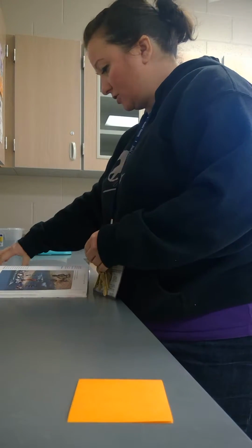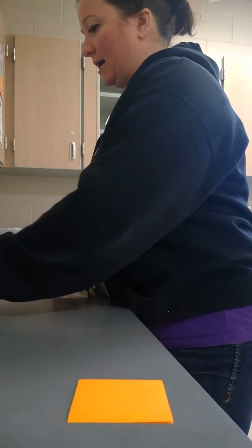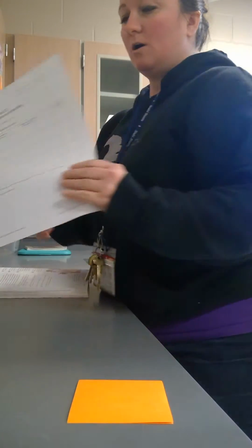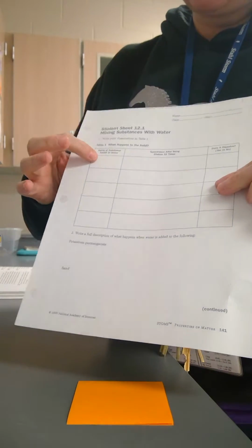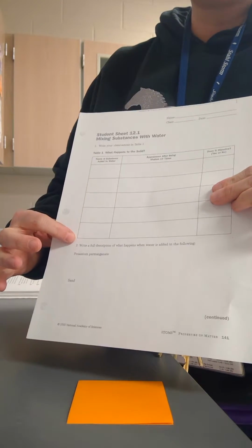All right, for getting started today, we're going to be dealing with some different substances. So on this chart, you're going to write the name of the substances going down. The first substance that we are going to work with is called sodium chloride.